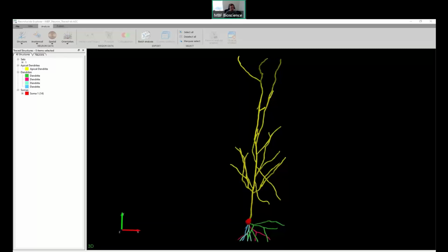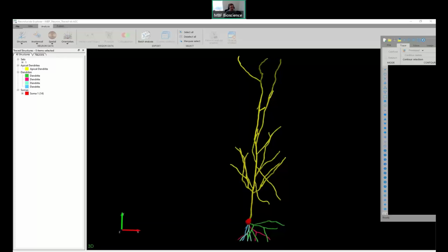Just as a follow-up question back, is this something that is being worked on between multiple images or in one image? That would be helpful to know on my end, so I don't answer the question incorrectly.